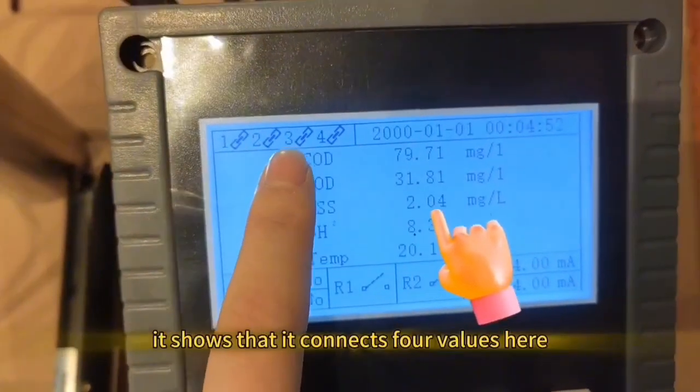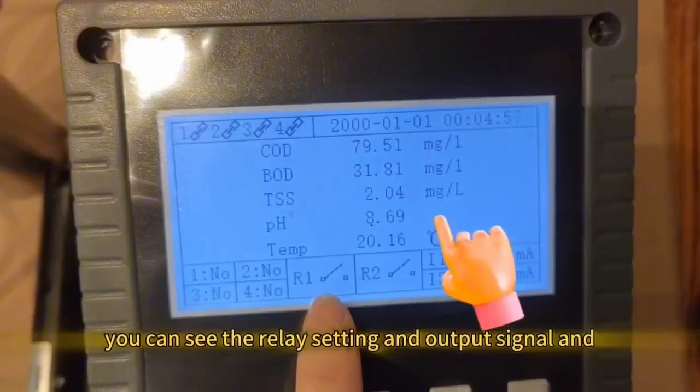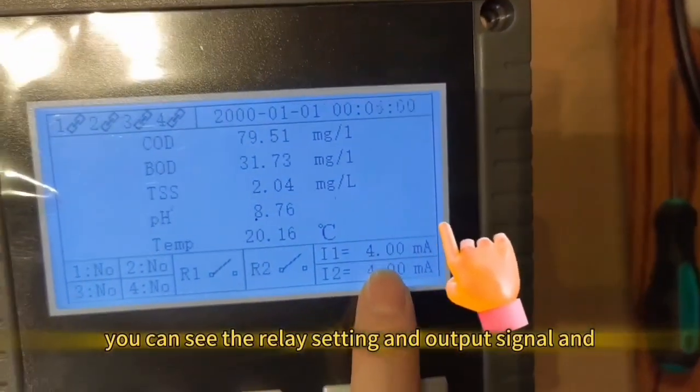It shows that it connects the four values here. You can see the relay setting and output signal.